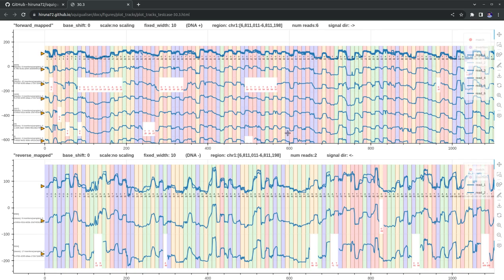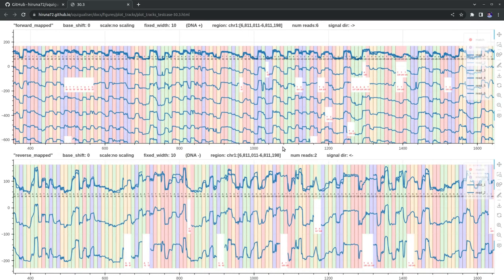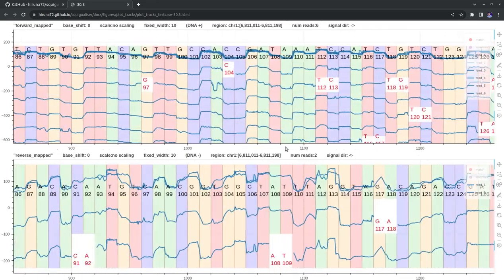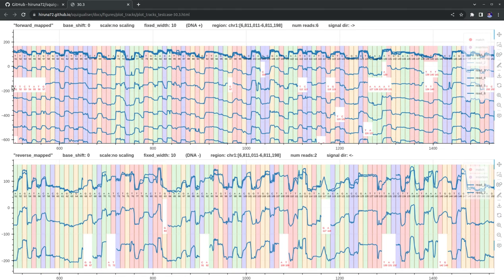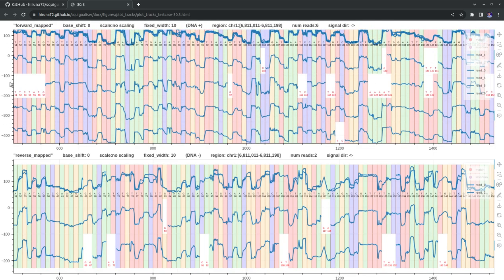You can see now the second signal is gone from the overlap. Another thing that I want to highlight is that if you place the cursor just outside the x-axis like this and you use your mouse wheel up and down, you can see how the x-axis is scaled up and down. The same can be done by placing the cursor just outside the y-axis. The y-axis scales up and down.